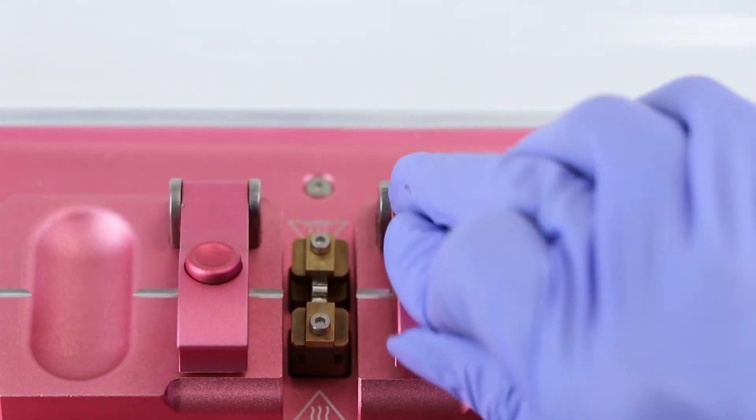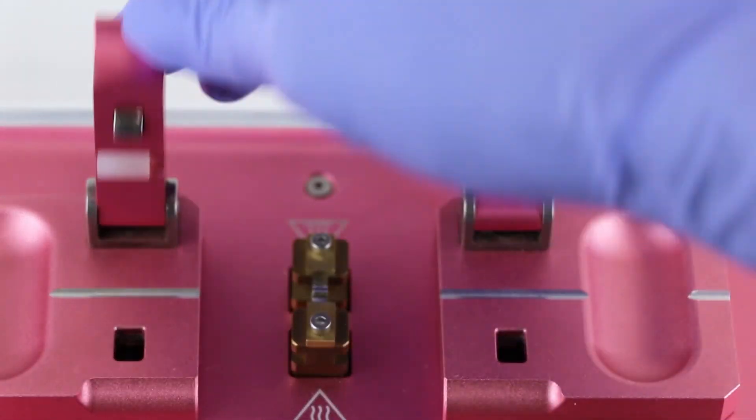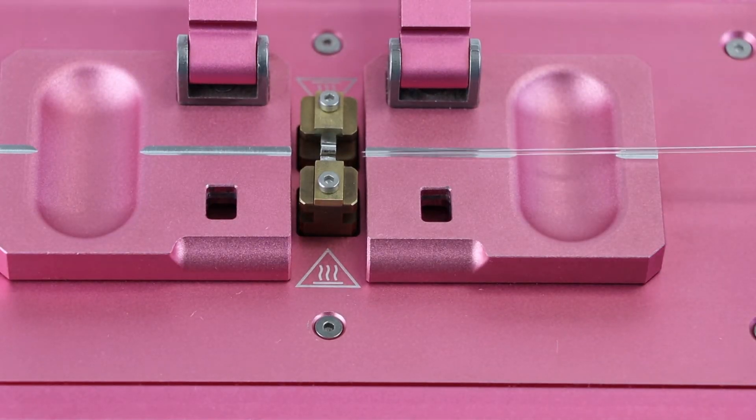To open the clamps, place your thumb under the clamp and depress the release button with your index finger. Now slide the glass capillary into the groove from one side.